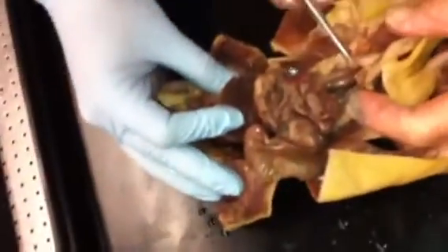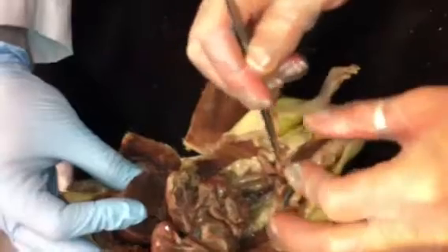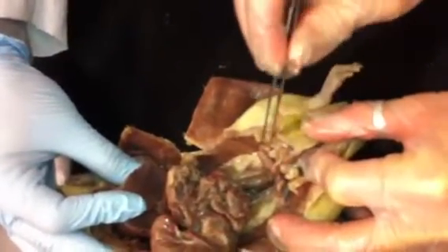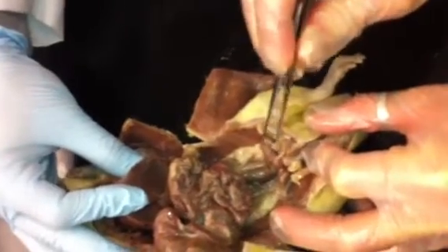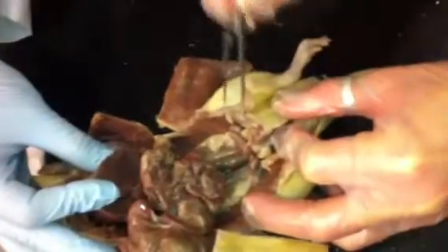And since you do have a male, we'll try to identify the urinary bladder. The urinary bladder is this tiny little pouch right here that almost looks like nothing. Like a bean. Yeah, it looks like a little bean. And what we're looking for are some of the organs of the male reproductive system. So there's a big pair of glands right here, this one and this one. And notice that they're lateral to the bladder. Yeah. So these are the seminal vesicles.